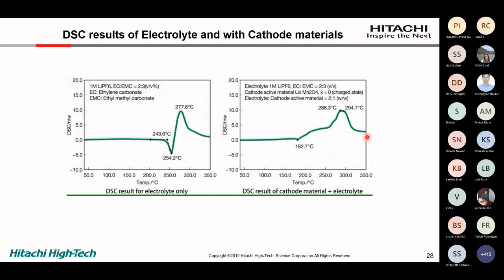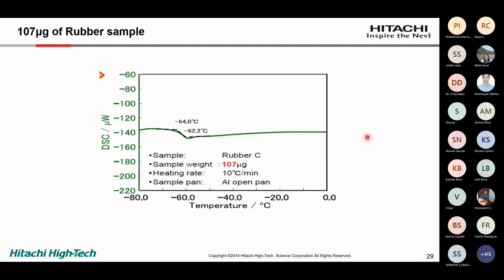So people are developing the electrolyte along with the cathode material on the basis of this exothermicity, so that we do not have failures in the field related to batteries burning or batteries exploding. So this is another application of DSC, used in the battery industry to quickly identify the safety hazard analysis of a battery material.